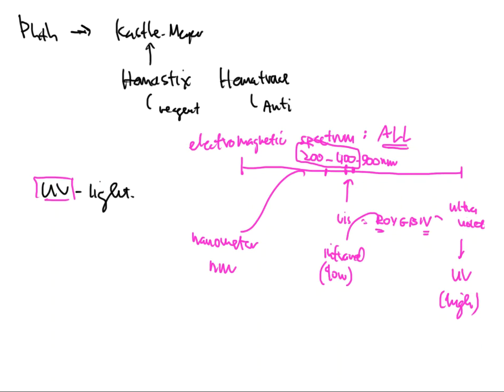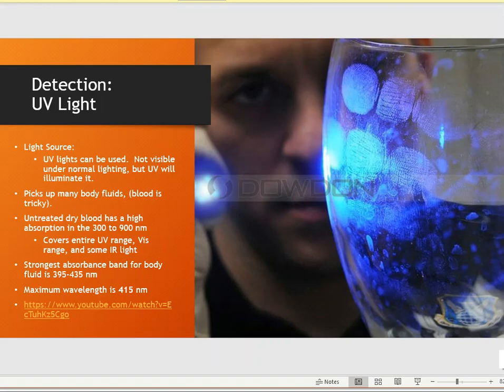Now, again, that 400 is very wishy-washy. Sometimes people will say 400 chop, and at 401 we're not in the UV anymore. It doesn't quite work out that way a lot of times, but we are just giving you a range, and that range is a rounded off range that's very easy to remember. So that way you can put this into your tool belt of useless information that you think you might not ever use again. But sooner or later it's going to come around and you're going to know what it is.